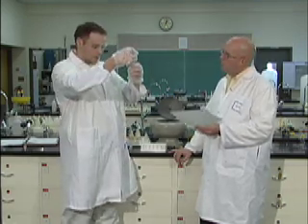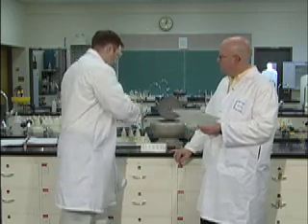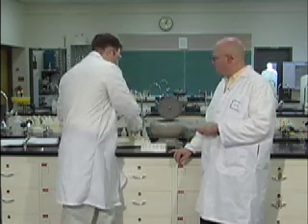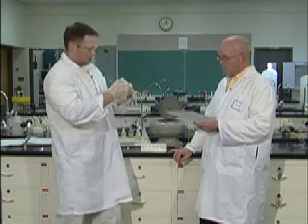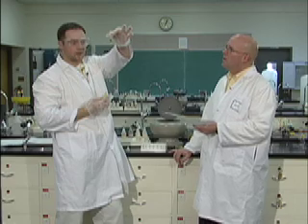And at this point, you should see that you get some steam rising, and of course the iron is dissolving back into solution. I gotcha. Okay, and from there, we're going to add something called potassium ferrocyanide. Now, potassium ferrocyanide in the presence of iron turns a bright blue. But in this case, we're probably going to get a yellowy blue color. Oh, I see a bit of the blue at the top. Yep. Okay, so that proves that we have iron.